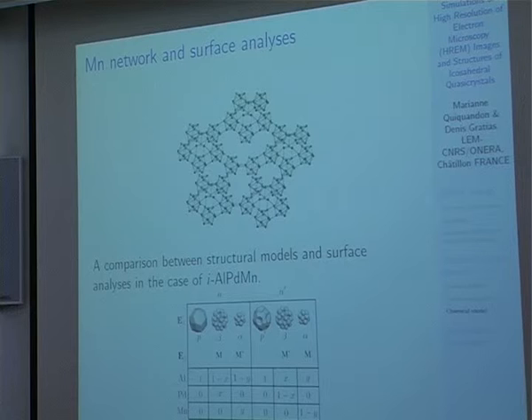So if you remember, in aluminium, copper, iron you have 12.5% of iron, and the iron atoms are placed at a smaller distance because you have 4.28% more iron atoms than the 8.3% of manganese, because this network exists only because of the alpha cell and thus the 8.3% of manganese.